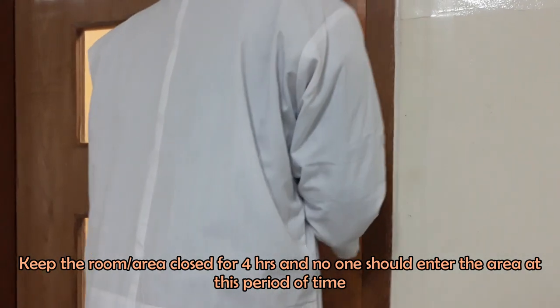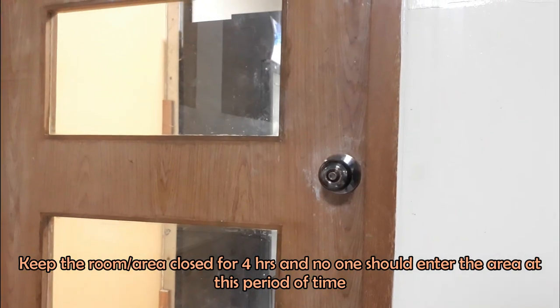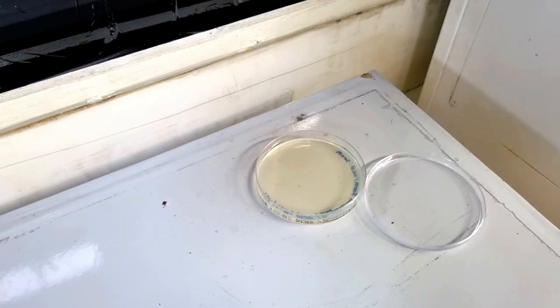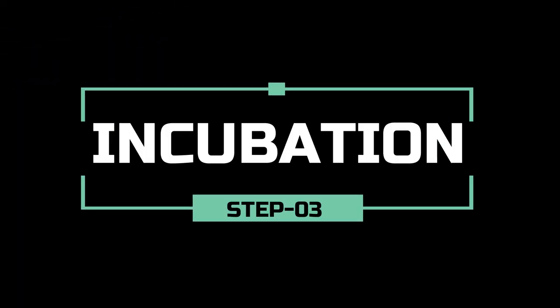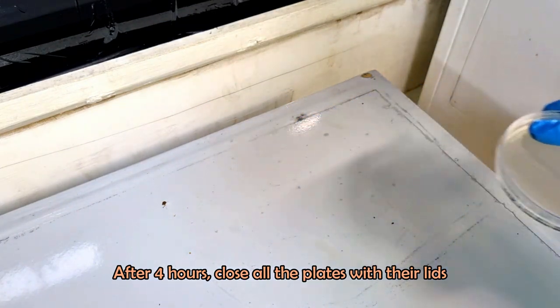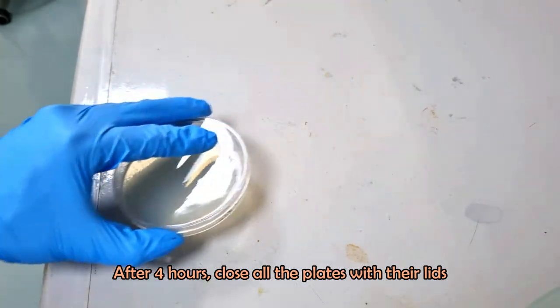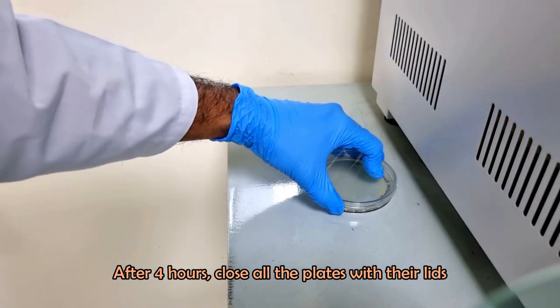Keep the room closed for four hours and no one should enter the room during this period. After four hours, close all the plates with their lids and incubate the plates at 37 degrees Celsius for 24 hours.